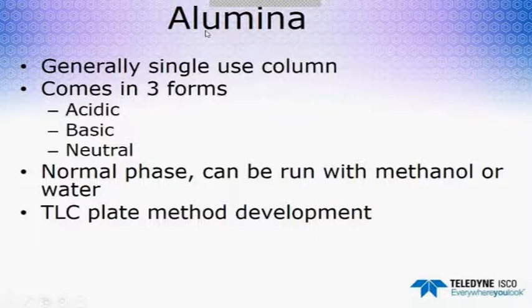Another alternative media is aluminum oxide. Like silica, it is generally considered a single-use column, and we have it in 3 forms: acidic, basic, and neutral. It's a normal phase column, and it can be run with either methanol or water, and we have matching TLC plates for method development.